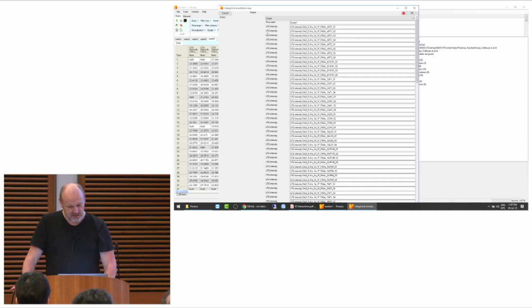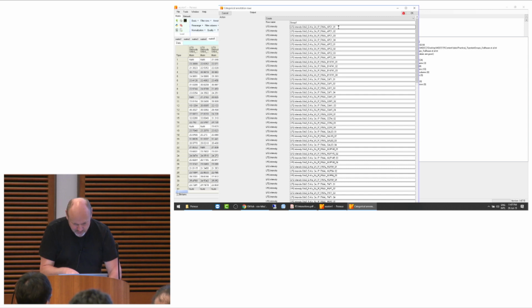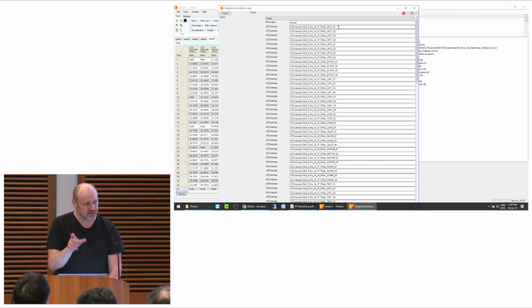One way you could create one is by just filling out all these fields. For each of the LFQ columns that we have loaded, you now have one entry here, and for each column you could specify the group it belongs to. For example, we would remove all of the underscore 01, 02, 03, 04, then we would have group names that exactly subdivide everything into these quadruplicate groups, right? But that's a long list, so that's a bit tedious.